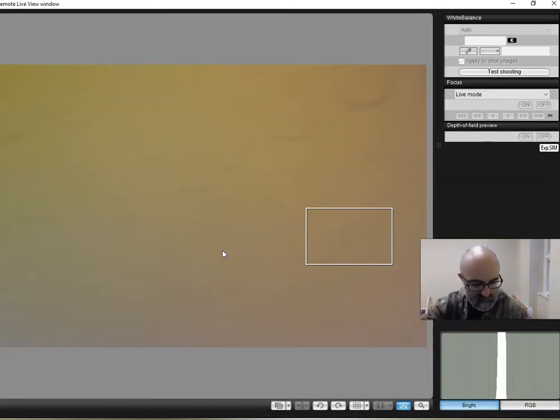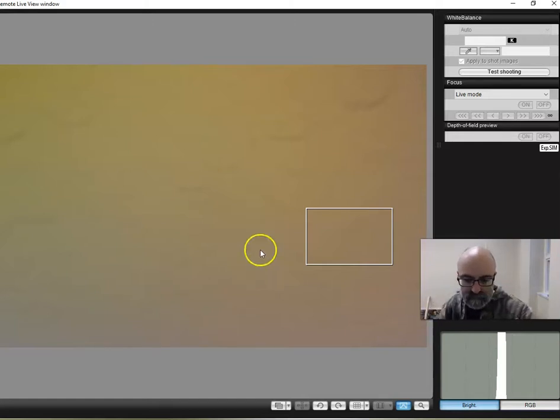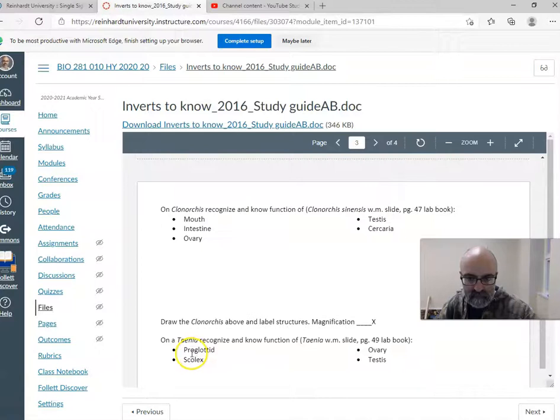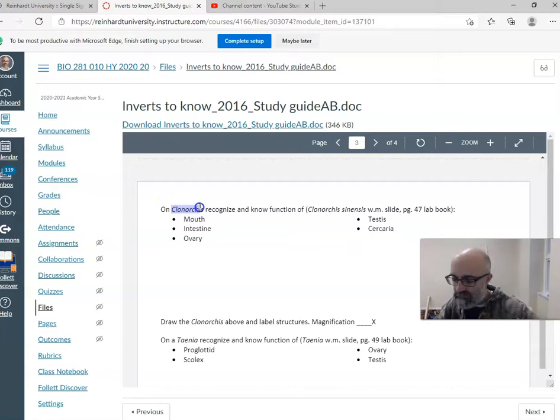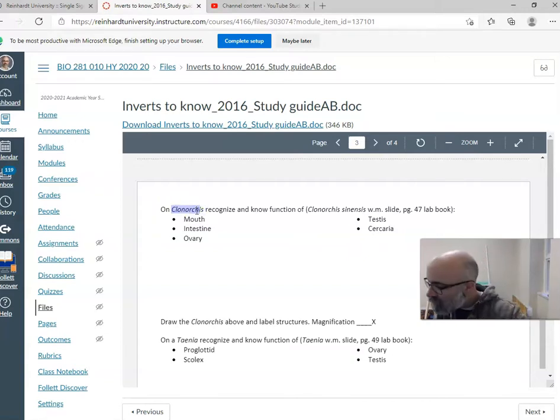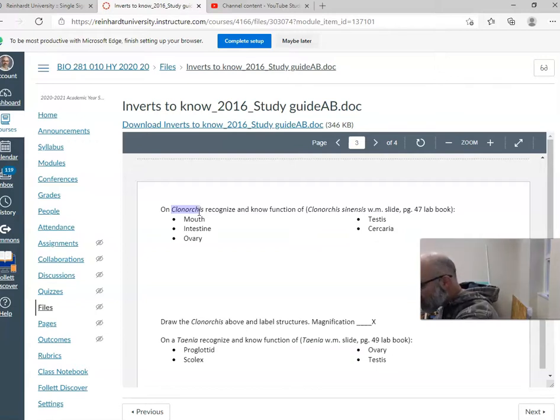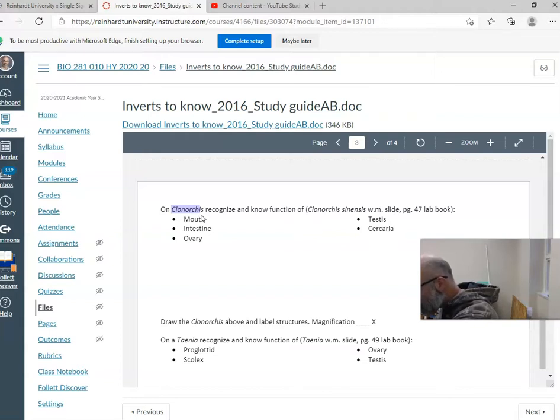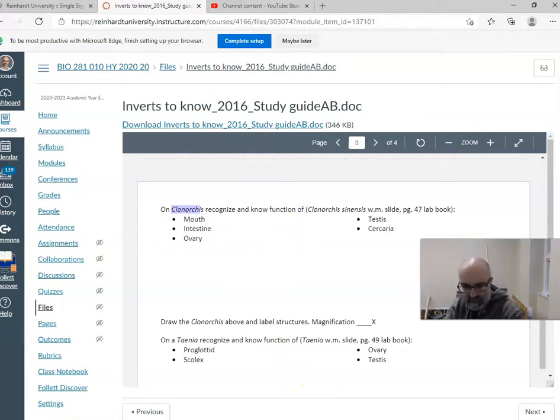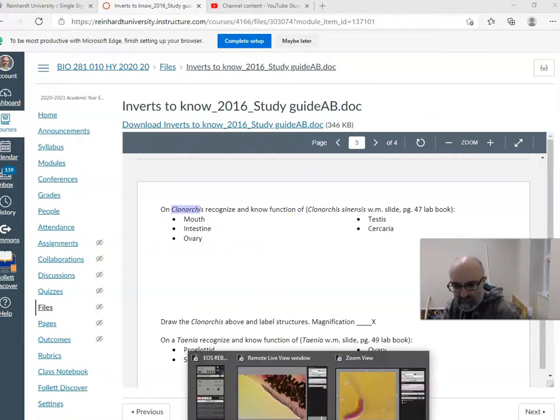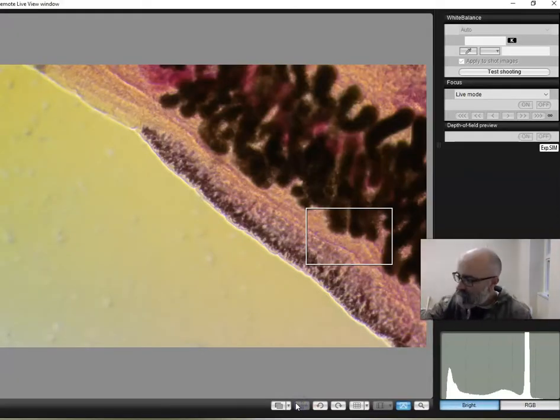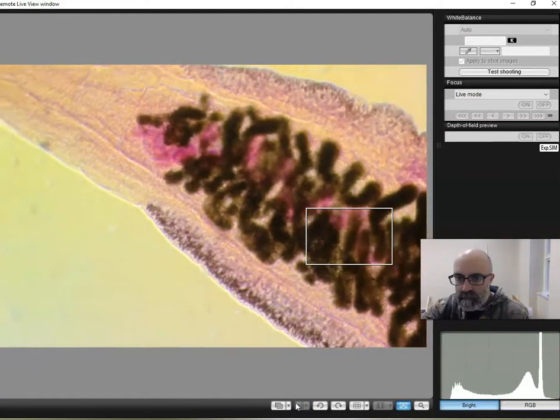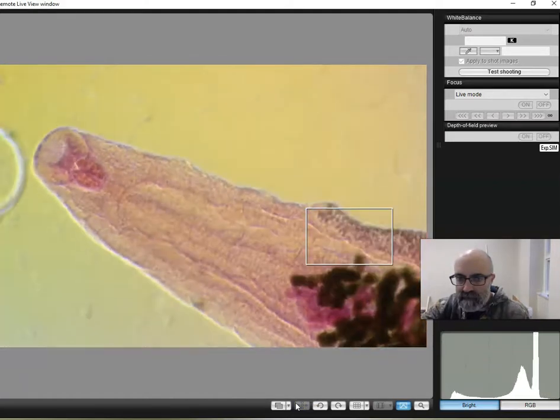And then the next group that you need to know within the platyhelminthes is this Clonorchus sinensis. Clonorchus is the genus. And they are a fluke, a liver fluke, an internal parasite. Here's our Clonorchus. Pretty big organism. This is a whole mount.